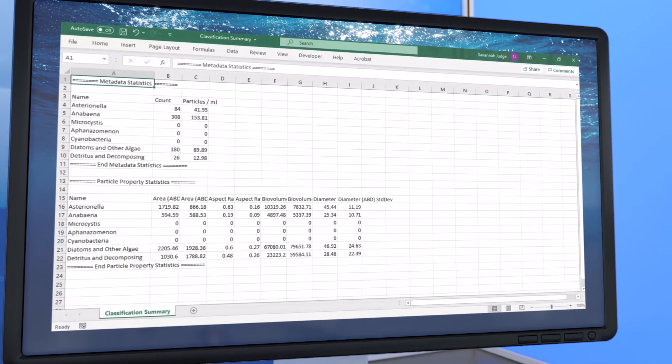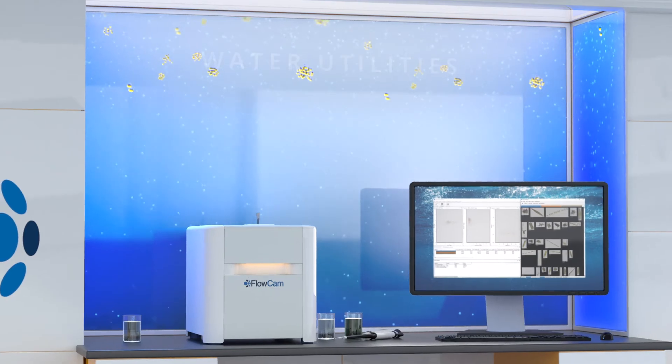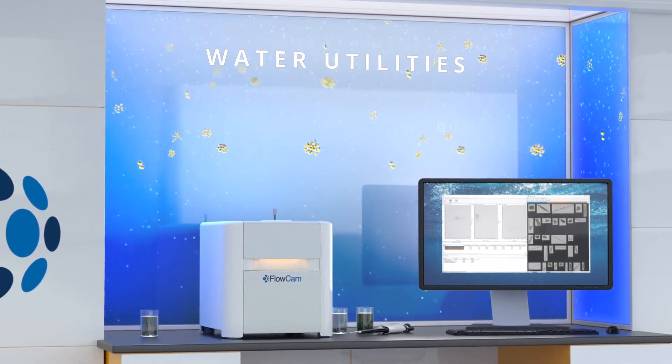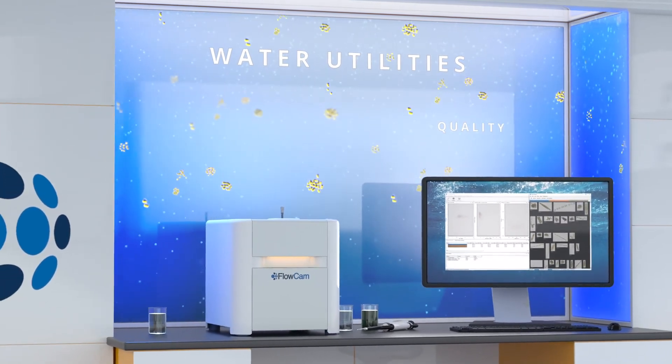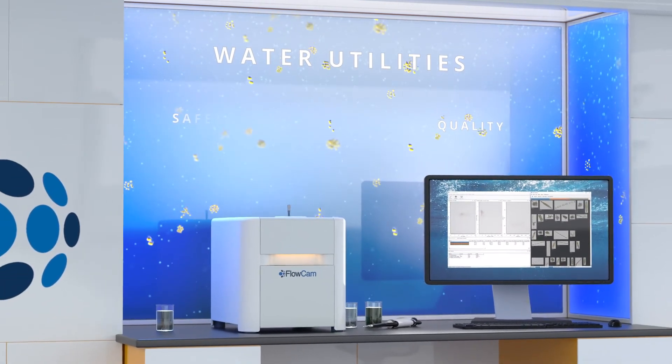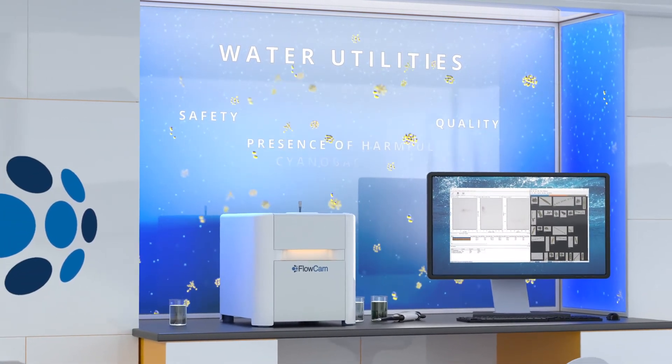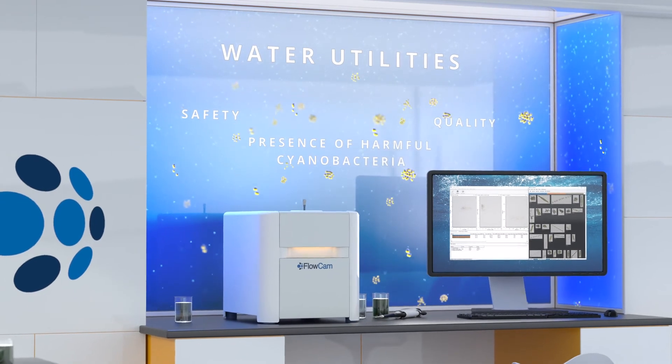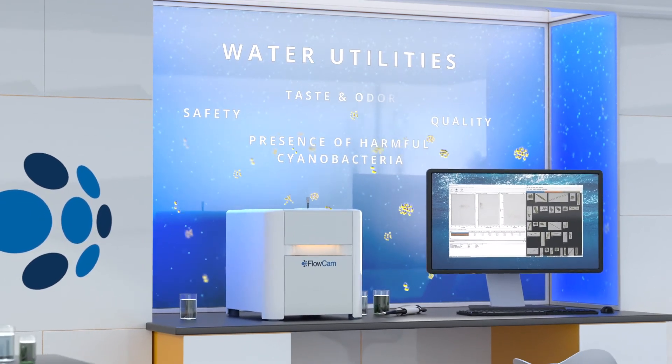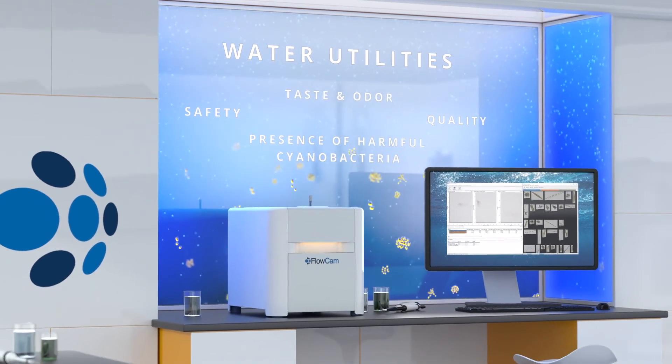Drinking water utilities use the FlowCam to proactively monitor water quality and safety, detect the presence of cyanobacteria, and stay ahead of taste and odor issues.